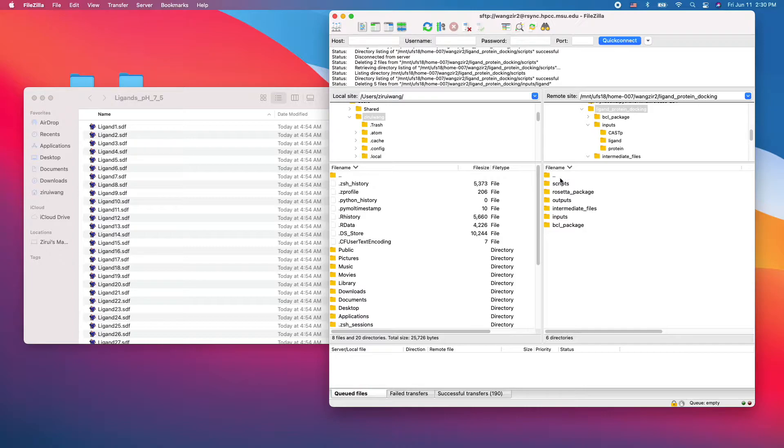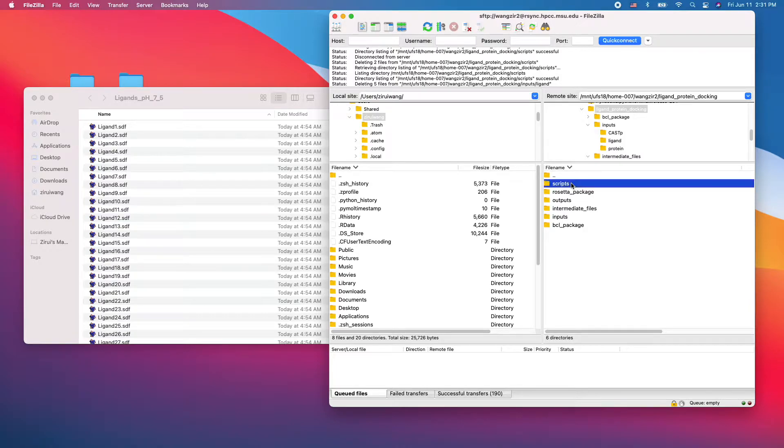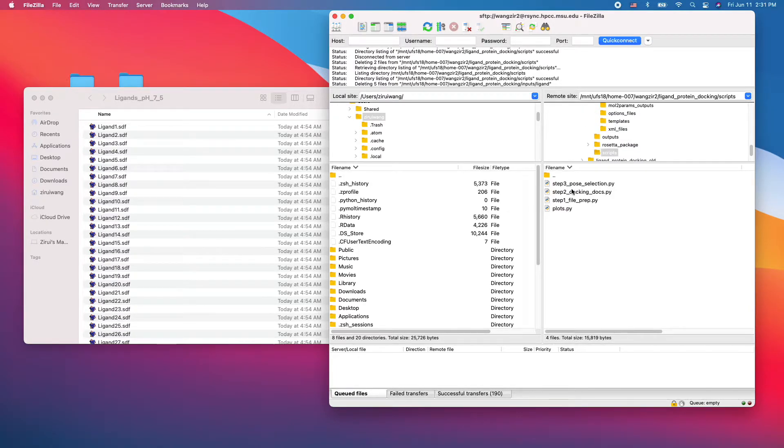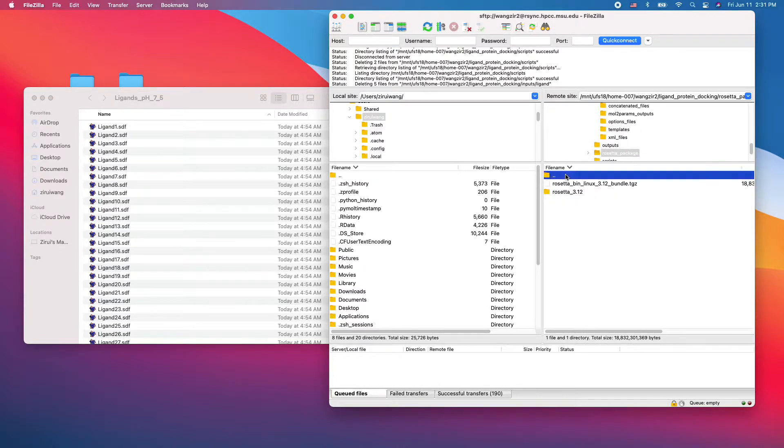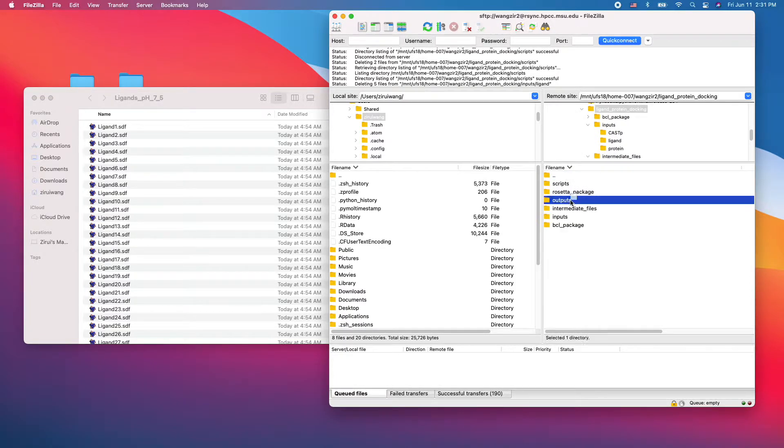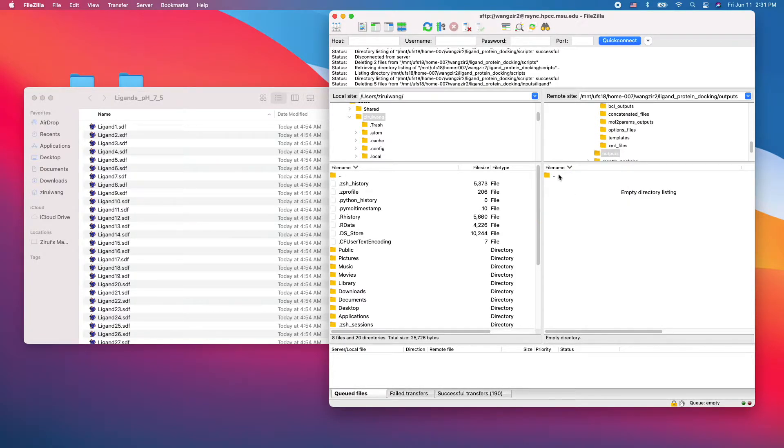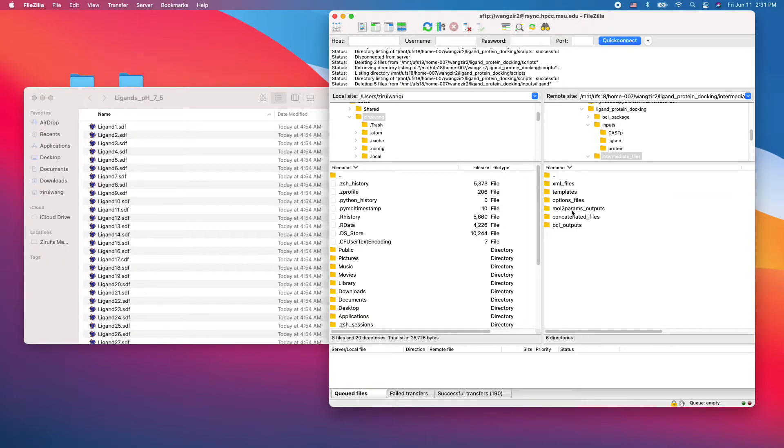Let's do a quick recap of our ligand protein docking folder. So, scripts, all the Python scripts in here, row setup package, output, nothing right now, intermediate files.